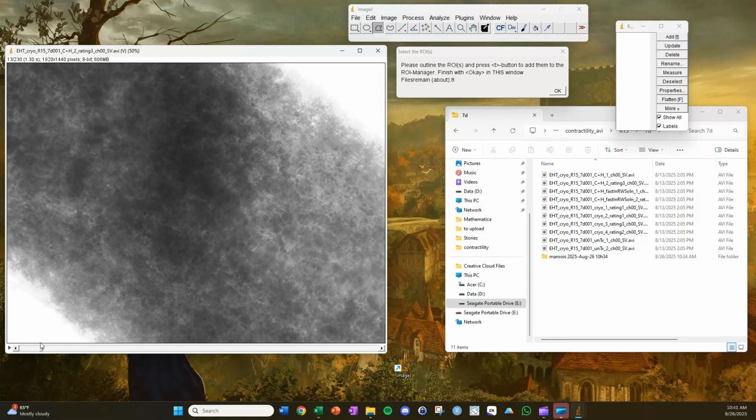And sometimes when the beating isn't that clear, it can actually be easier to not go frame by frame and just scroll through. For these cases, what I typically do, instead of trying to pick the frame of the lowest area that the tissue occupies to be the reference frame, is just to pick the frame where I think the contraction happens.